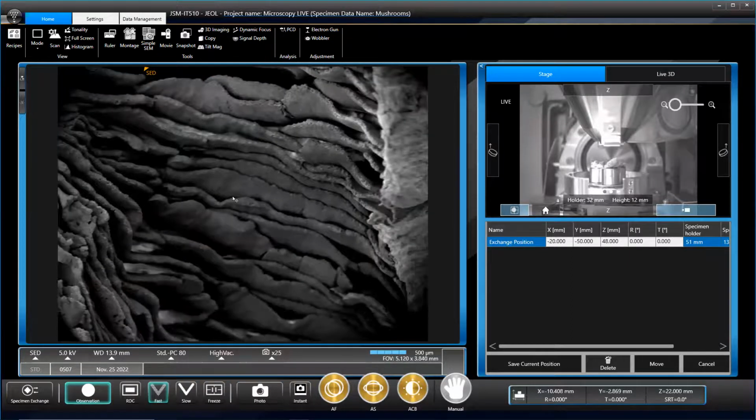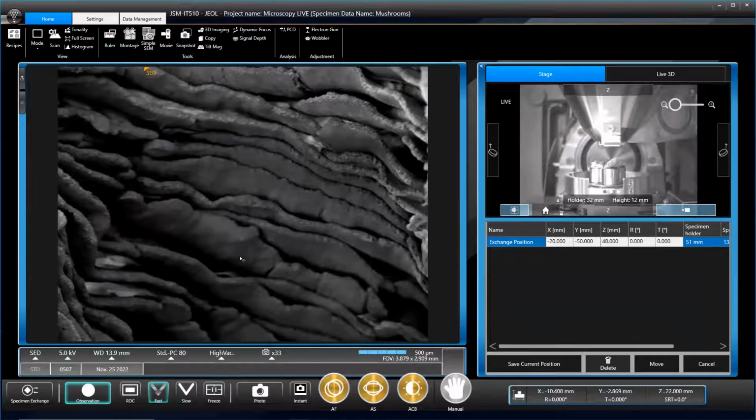So this is the inner side. So I guess the stipe is on the left, isn't it? You see them all kind of going to that left corner, so I guess that's where they're joining. It's the stipe or the stalk. So you've got the cap and the stipe.